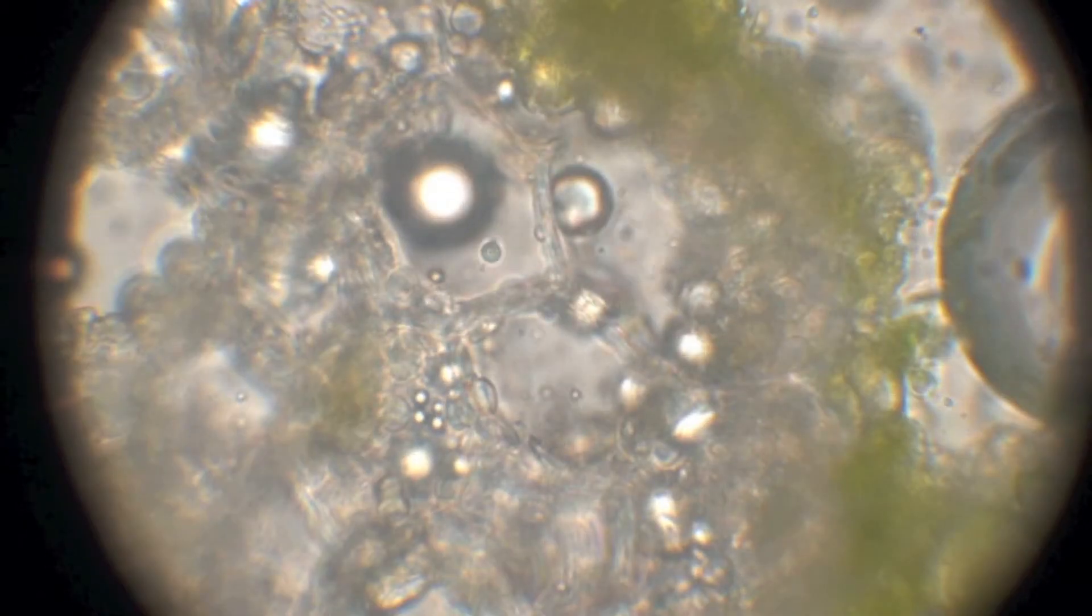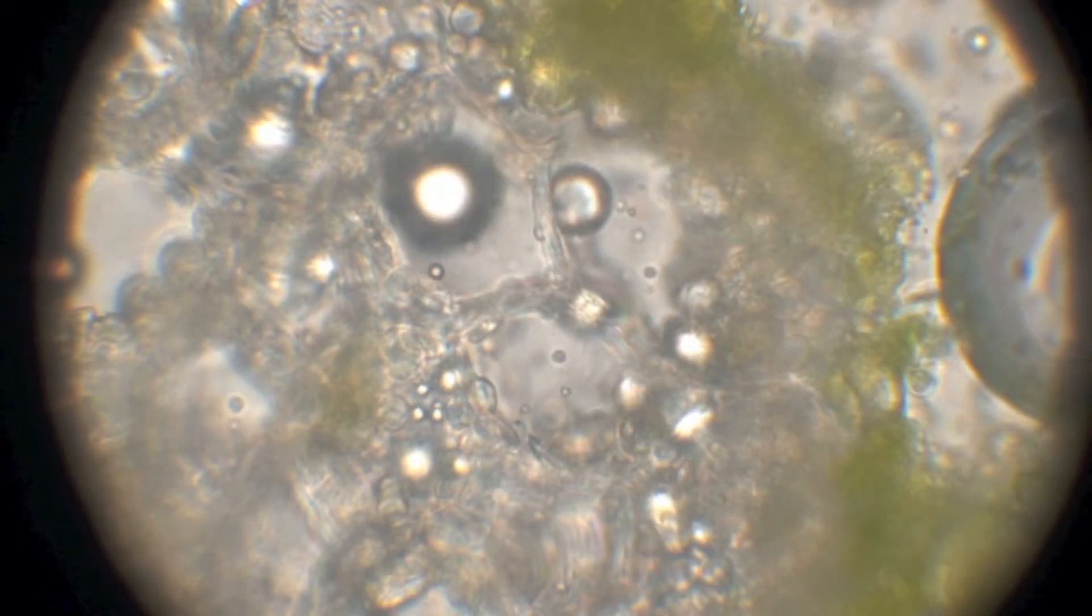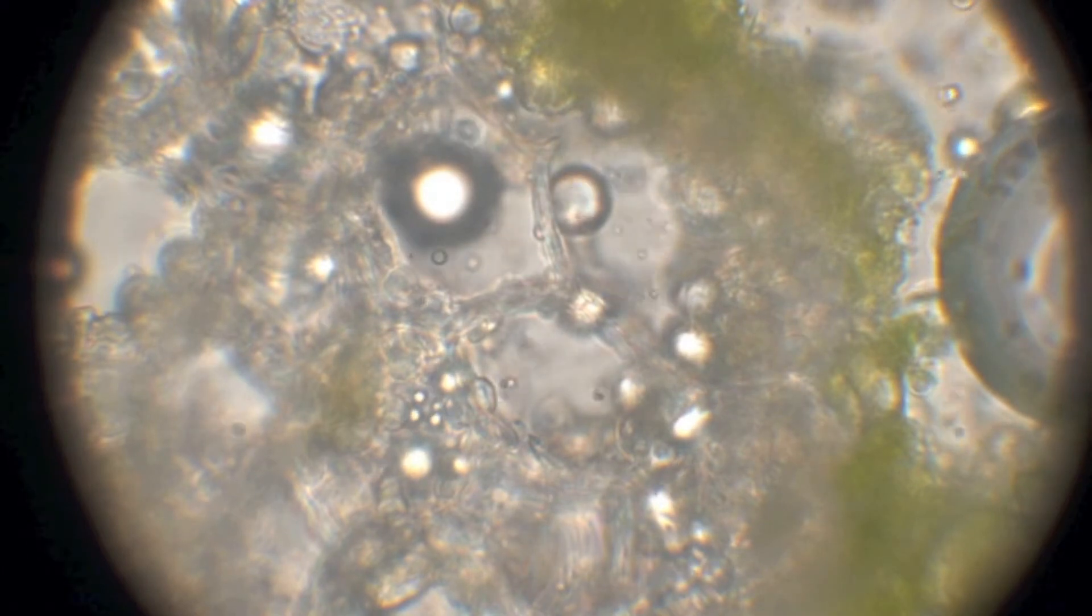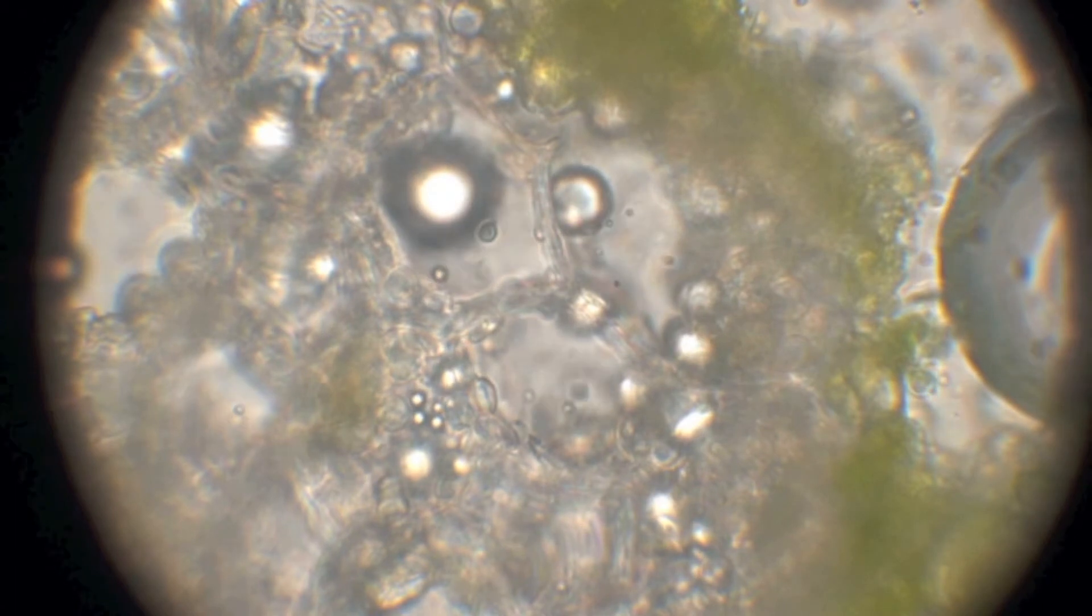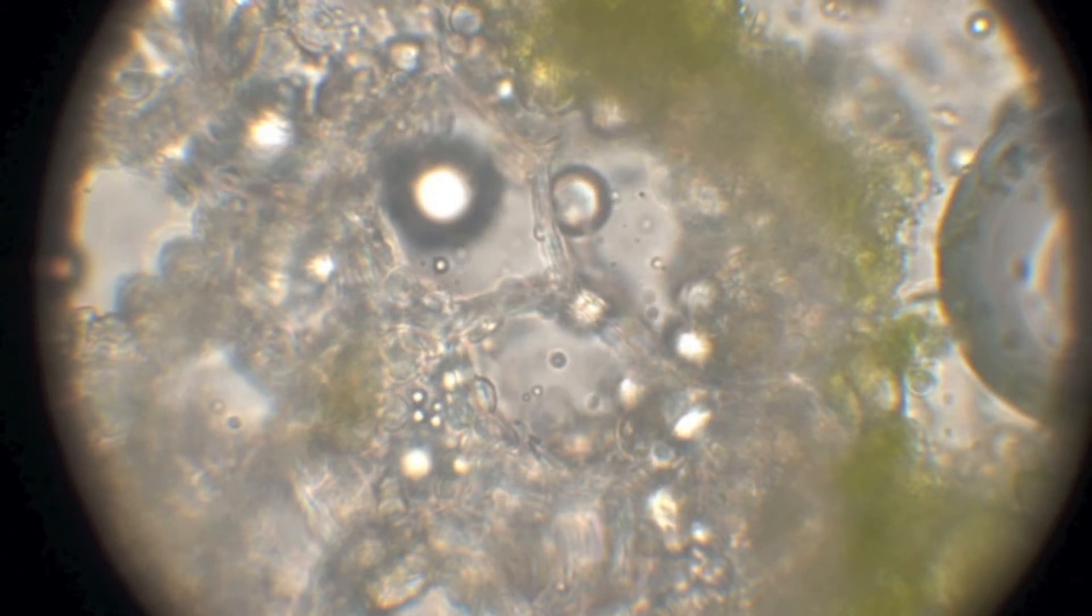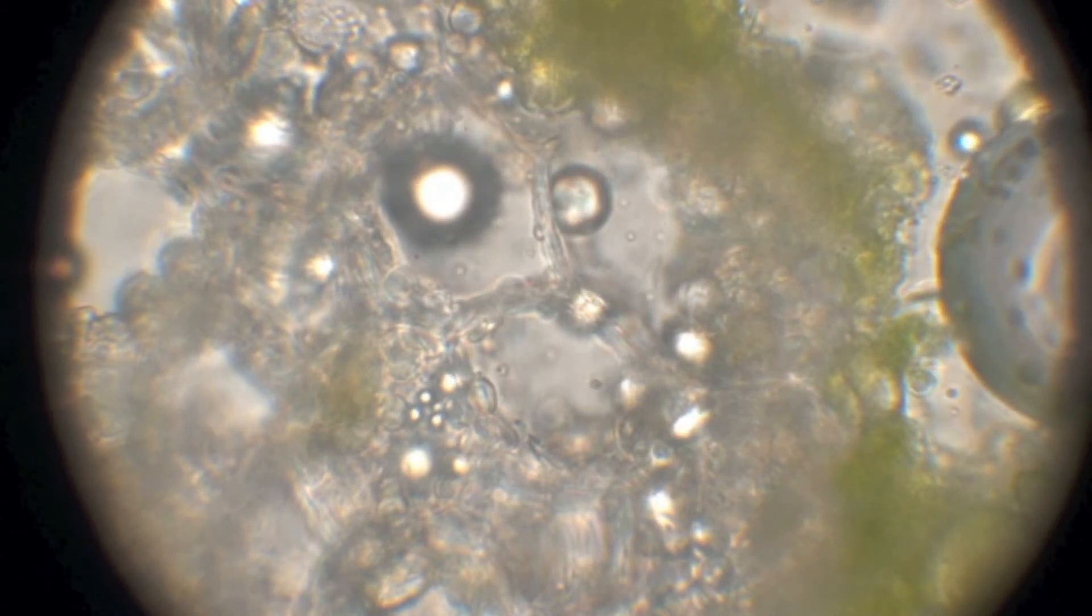I thought it would be fun too to show you a live shot of some of the organelles inside the living tissue moving around. There might be some bacteria in here, some microbes, but a lot of these are organelles that are part of the plant structure.